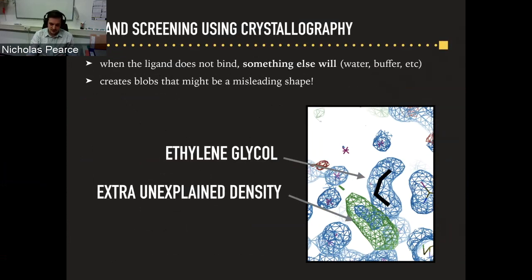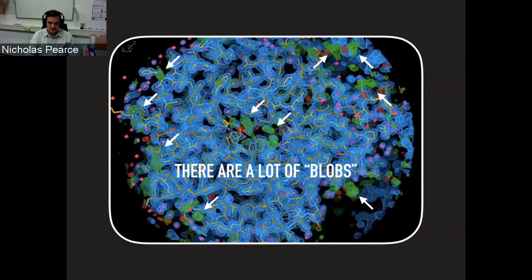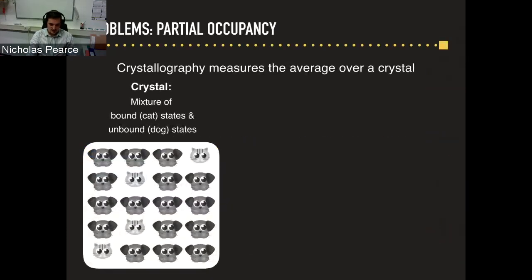If your ligand adopted a particular shape, you could possibly misinterpret that density as your ligand. This is a particular problem because there are a lot of blobs in crystallographic data sets all over the surface of our protein. So what we want to know is: which blobs are my ligand, and how do I model my ligand? This is made even worse by the fact that our crystals are heterogeneous — they contain multiple protein states. Taking a facile example: we have the unbound state of our protein, which is a dog, and the bound state, which is a cat.